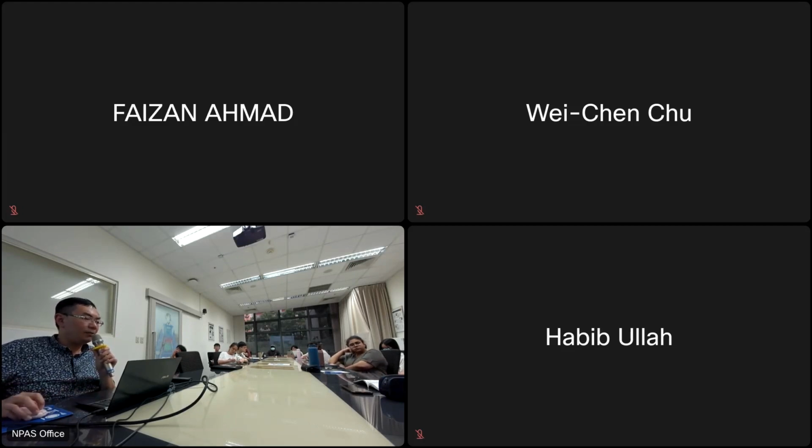Now we can distinguish that there are three objects, 1, 2, and 3, and the background is filled with 0. So the maximum value of this image also represents how many objects are in this image.